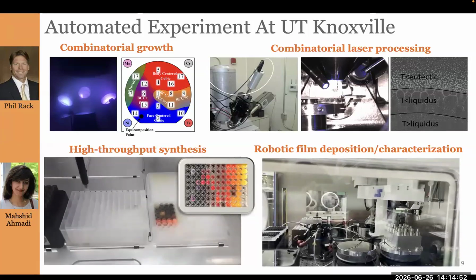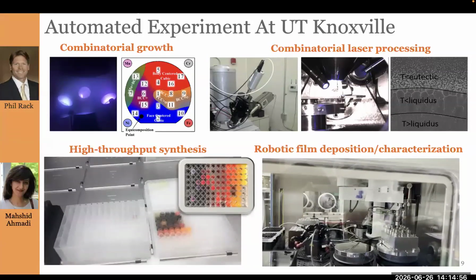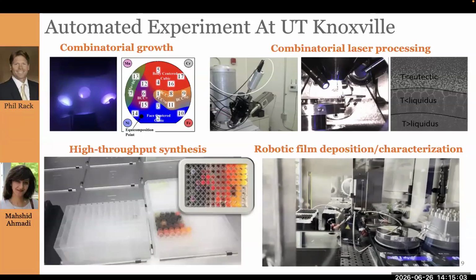Either it can be a combinatorial growth, when we can realize some compositional or property gradient across the wafer, across the sample.